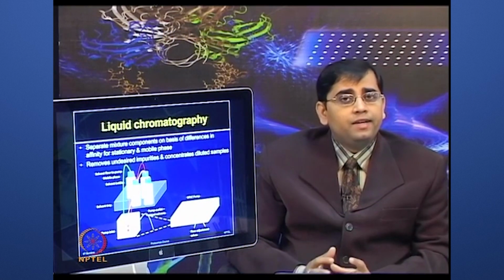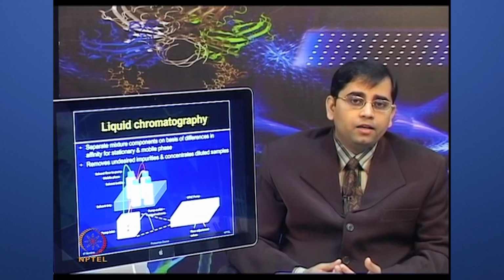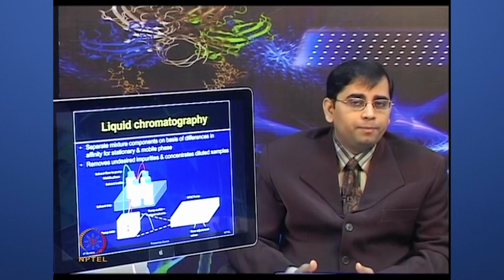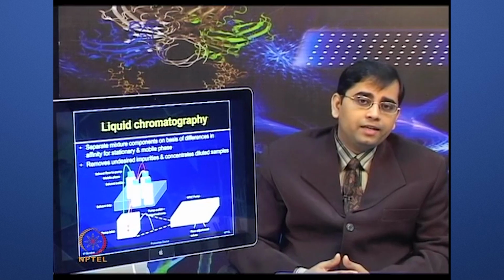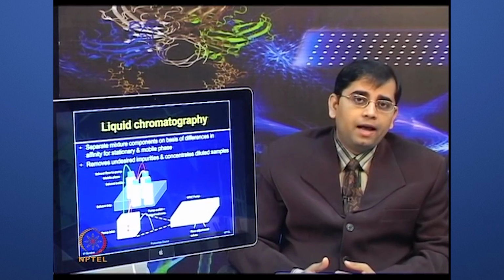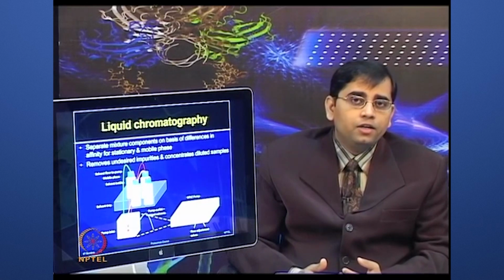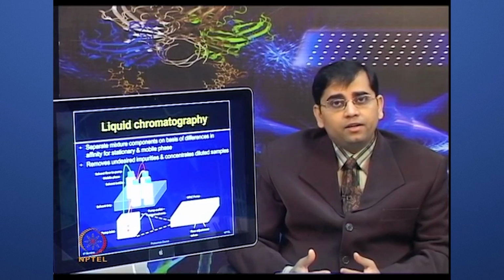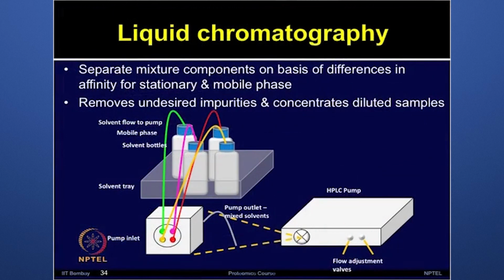Therefore, for various types of mass spectrometry based applications, it increases the reproducibility and robustness for analysis of peptides and proteins. It also concentrates diluted samples and therefore increases the detection sensitivity for low-level proteins when you are applying different types of proteomic technologies. It is mostly used for separating peptide mixtures.